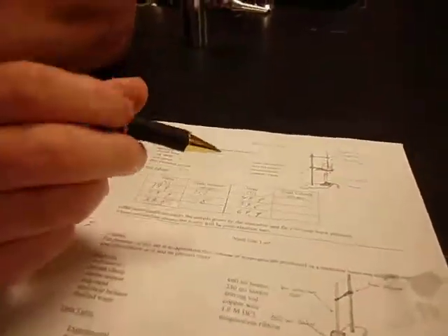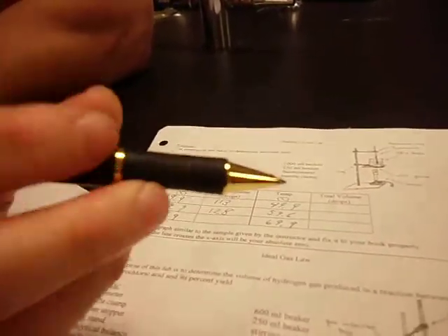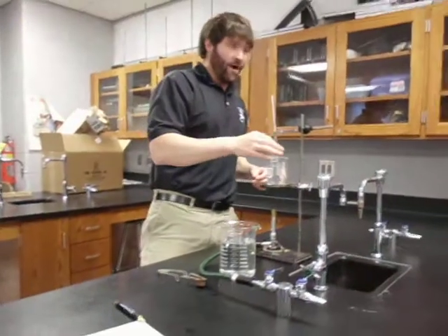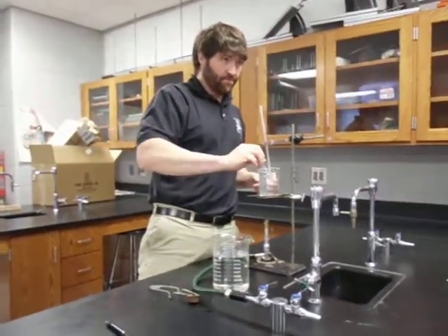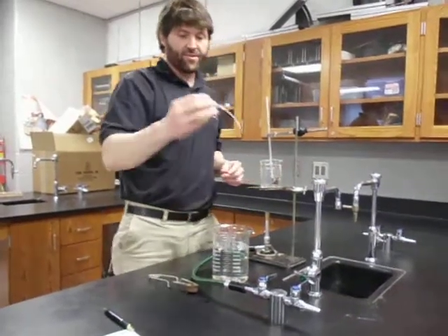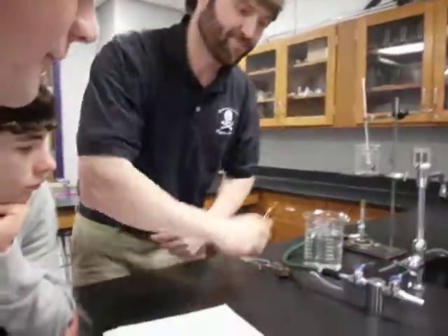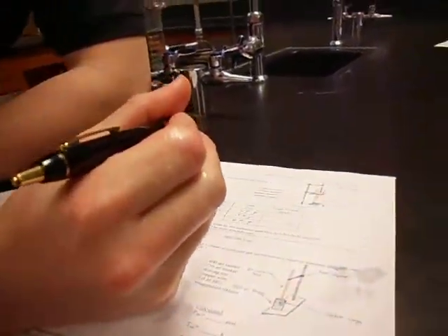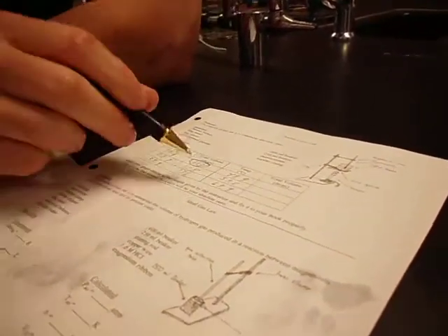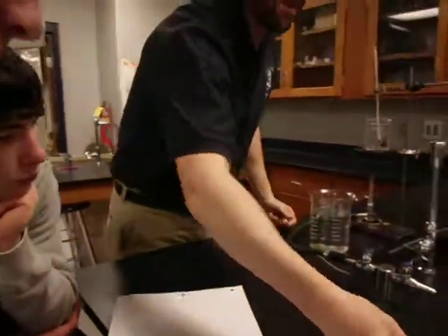This is the part where everybody messes up. From here on out, every time you do this and count drops, you add back every time to that first number — 113. You don't add to the previous step's total. So if we heat up to 39.9, stick the pipette in, pinch it, submerge it, let go — and it sucks up 23 drops — we add that 23 to the 113, giving us 136 as the new volume. Keep doing this all the way to your last temperature.